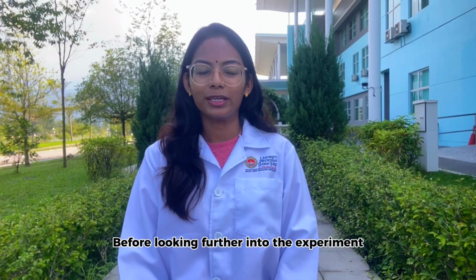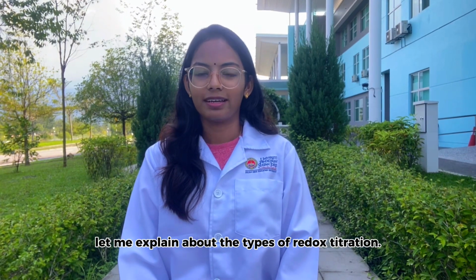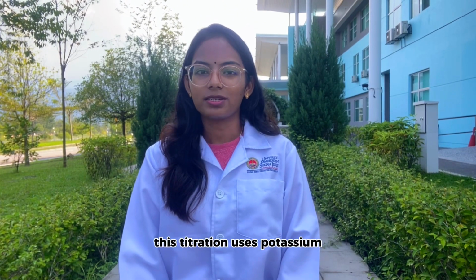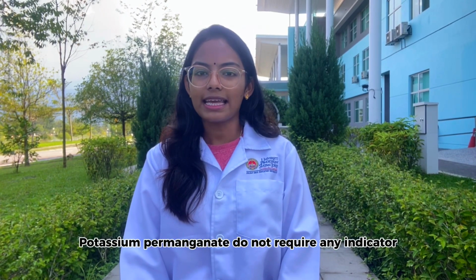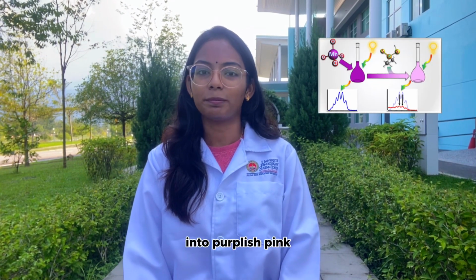Before looking further into the experiment, let me explain about the types of redox titration. There are 5 types of redox titration. Firstly, permanganometry titration. This titration uses potassium permanganate as its oxidizing agent. Potassium permanganate does not require any indicator as it has the ability to change the analyte's color into purplish pink.